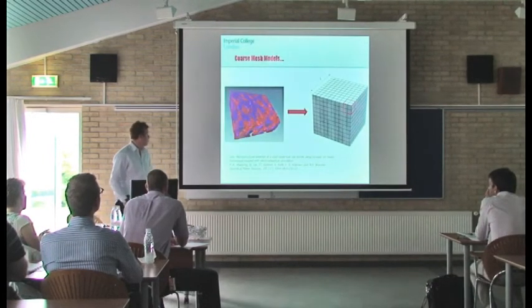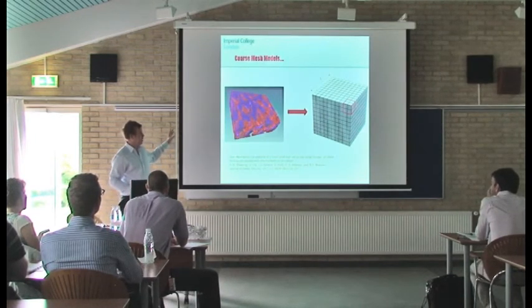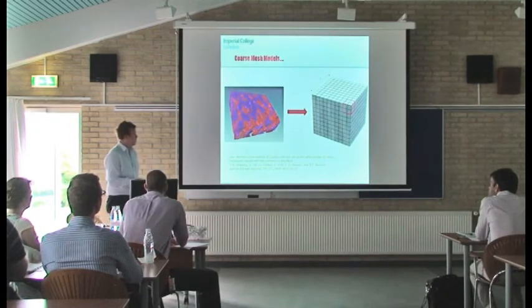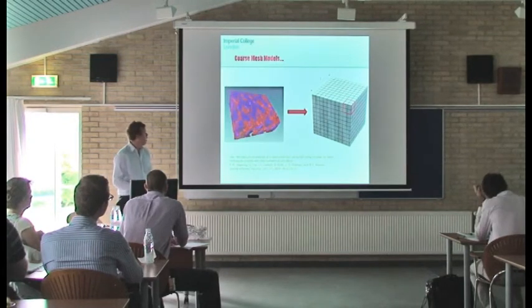The second model that we use is a volume of fluid method, so taking some focused ion beam tomography data and then doing some level of coarse meshing to take some volume of fluid units and then modelling transport and electrochemical current generation in these structures. And this is, I think, a very core area of our work, but one that Nigel's going to talk about in much more detail, so I'll leave that to him.